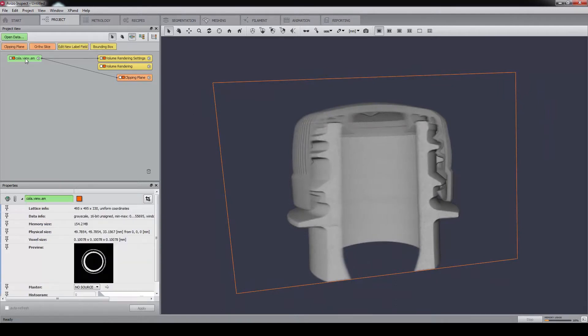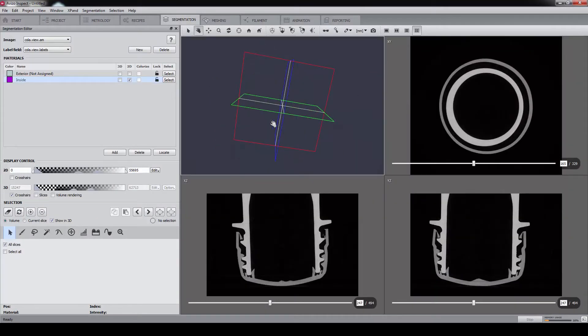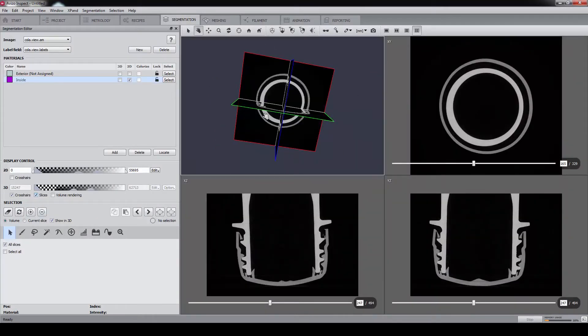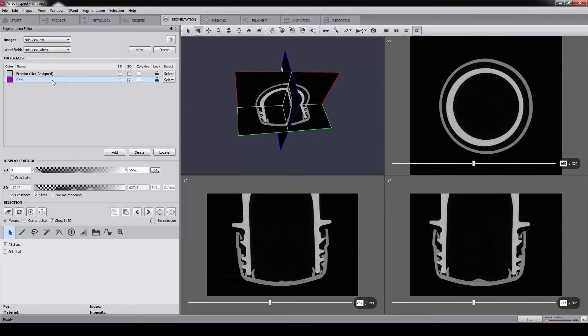Attaching an Edit New Label Field module to the data triggers the opening of the segmentation editor. As a start, we need to define our three materials: the cap, the bottle, and the rest, which is more or less the air.